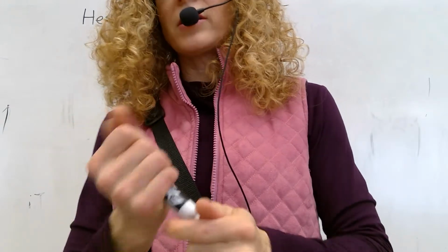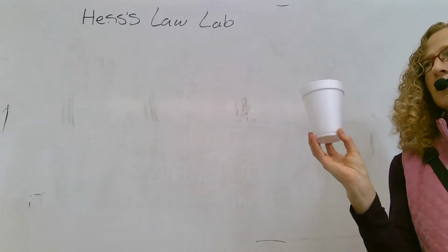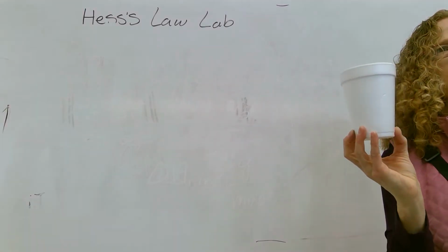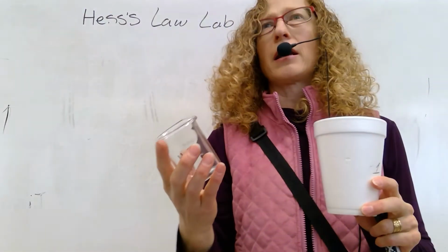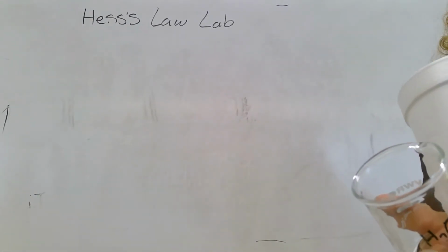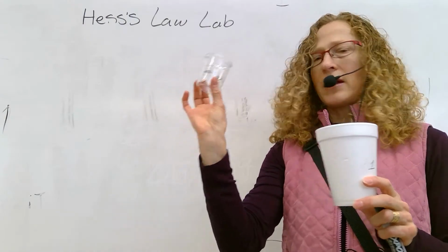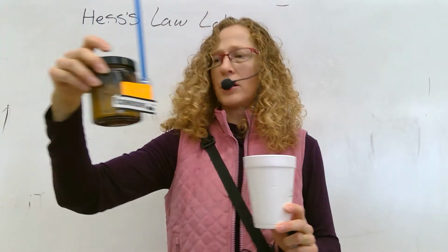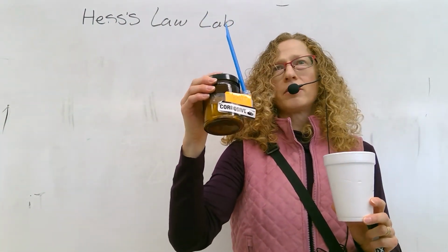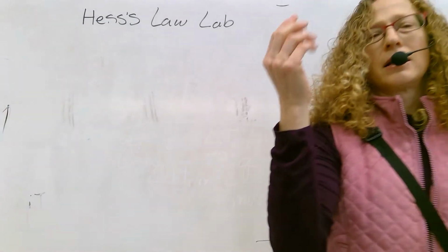And what I suggest on the first one is get the mass of the cup. And you have a small beaker, get the mass of the KOH. And the first one is water. No, excuse me. The first one's water. So you're going to have KOH in here. And by the way, the KOH is solid, and you don't really want to touch it. It's a base, and if you get it on your hands, you should rinse your hands, but it'll be kind of slimy. A base, you can't get the last layer off.